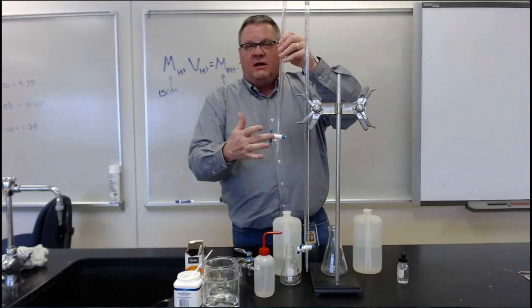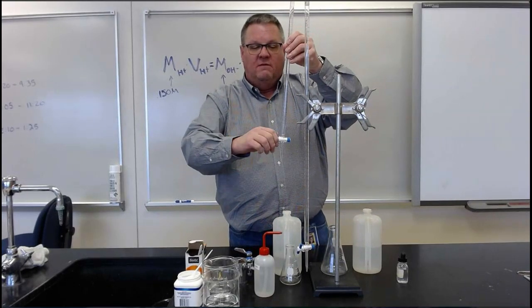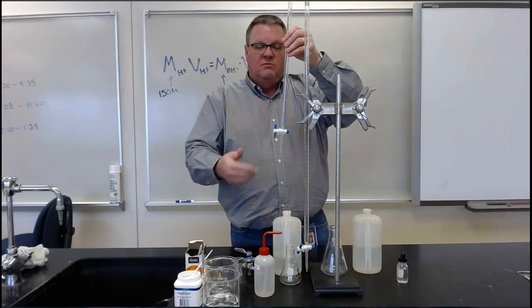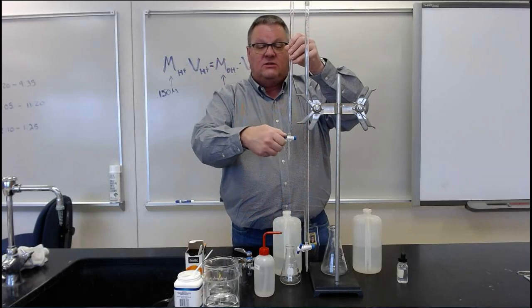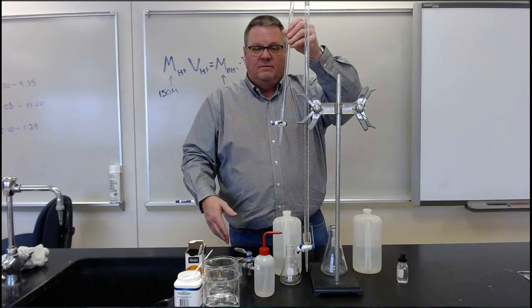This is a stopcock here. It has a valve. If it's with the flow of the liquid, it's on. If it's perpendicular, it's off. And so the first thing that's important before you start filling this up with acid is close the stopcock so that acid doesn't come leaking out of here.